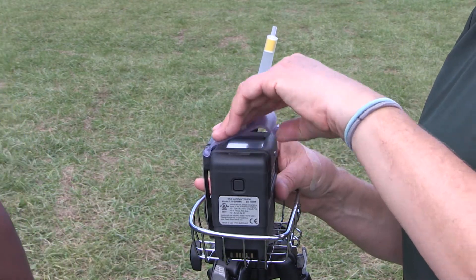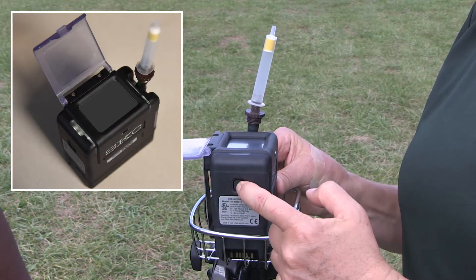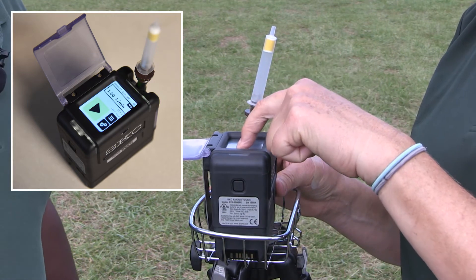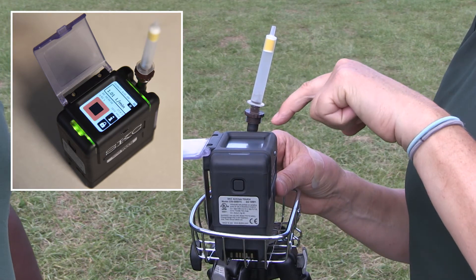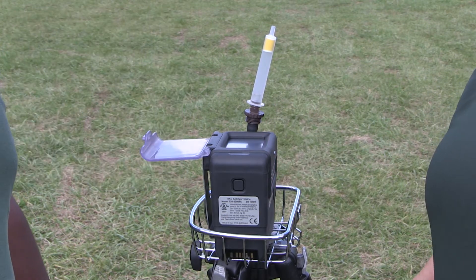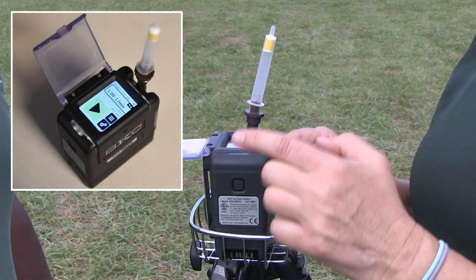Go ahead and open up the cover, then press the start button. You can see it's working because we've got green lights here. After the full hour, it will stop on its own.